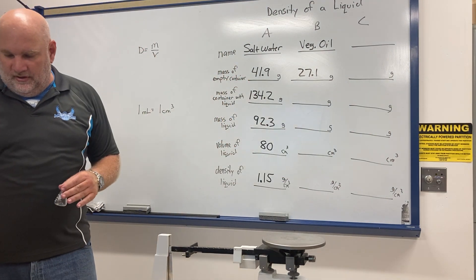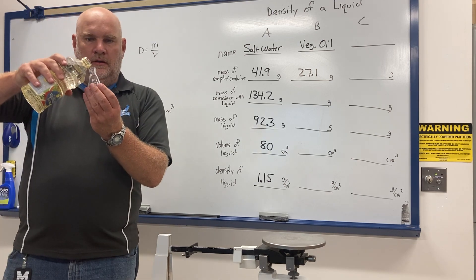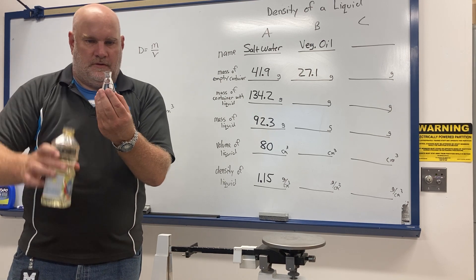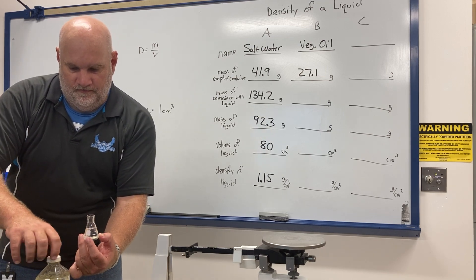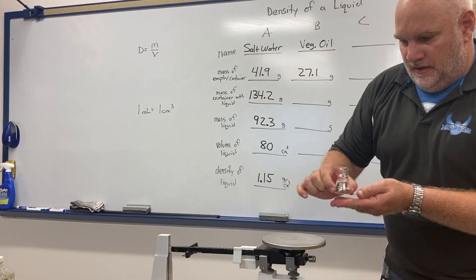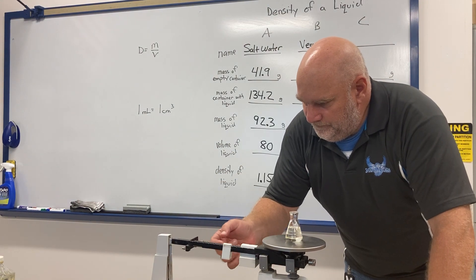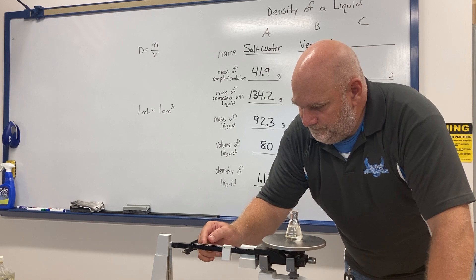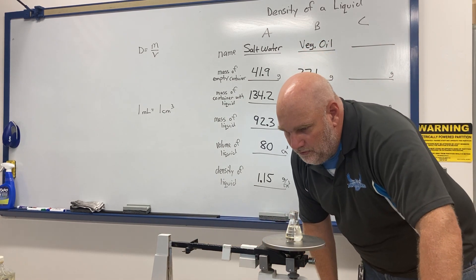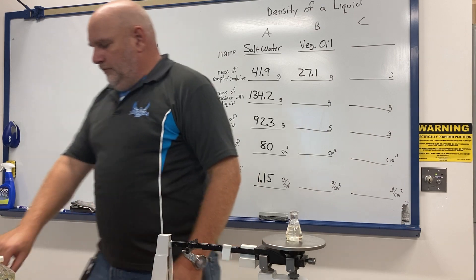Now I pour some vegetable oil into the flask — be very careful, this is messy. I take the flask with the vegetable oil and put it on the balance to find the mass. I get 49.2 grams for the mass of the container with the liquid.